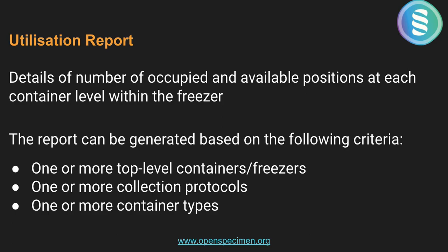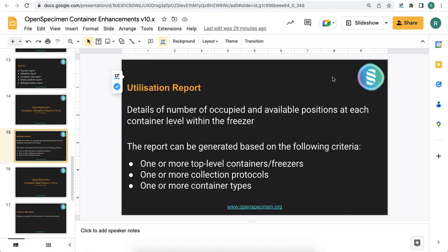The report can be generated based on three different criteria. You can choose one or more top level containers or freezers. You can also select specific collection protocols. You can also choose different container types. Let's see how it looks in the environment.